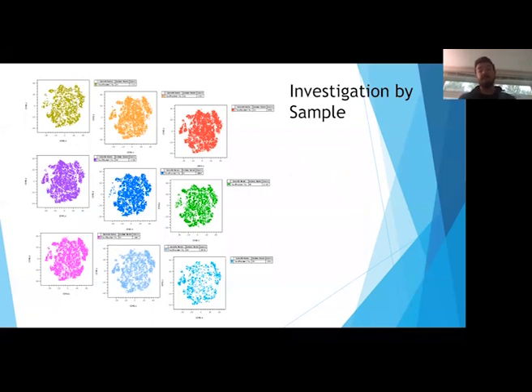Once you've done this gating, again, you can view those t-SNE parameters by sample. We can see, for example, the very first A1 sample seems to be missing a lot of the population that we identified as potential monocytes. Similarly, it looks like A5 has a similar grouping, with very few cells in that set of islands. There are all sorts of inferences you could make once you've begun to dissect these different islands, these different populations within the t-SNE mapping, and then look at those across all samples.